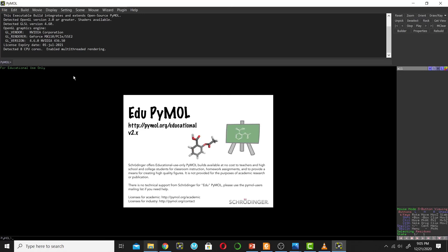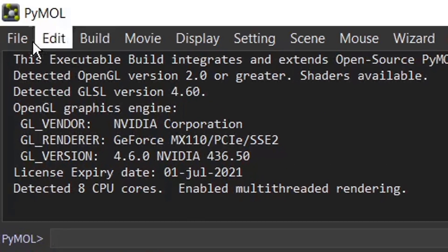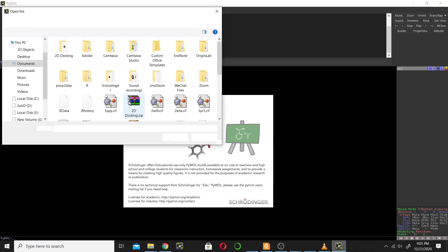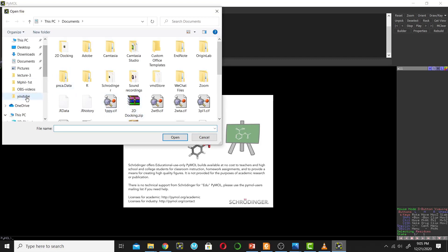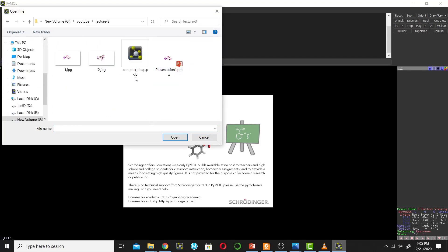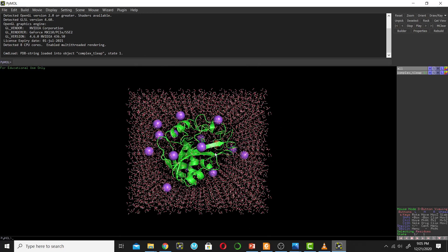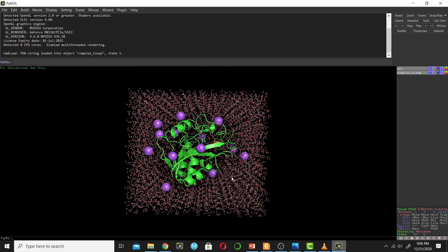This is the user interface of PyMOL, we call it GUI — graphical user interface. Now I will open the protein. To open the protein in PyMOL, go to the File menu and click Open, then browse for your protein. This is my protein, which I have previously simulated.